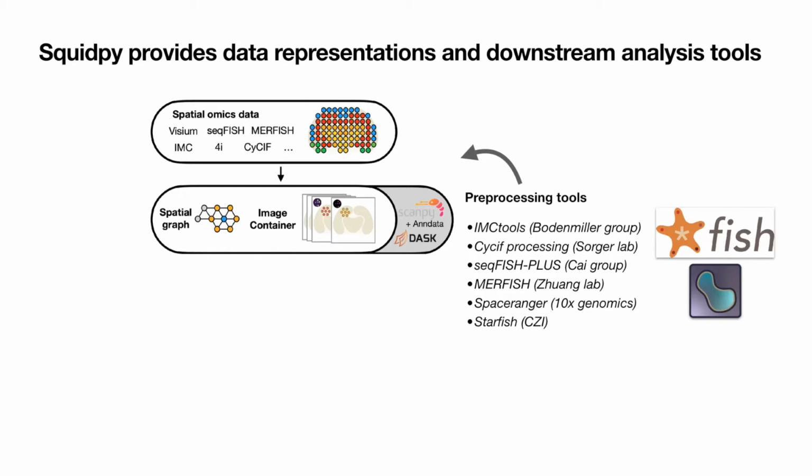Okay. For the data representation that I just talked about, we have one lab coming up. This is the spatial AnnData lab. This is something you can really get your hands on, and we'll provide a couple of examples of how to create these representations in the code and how to work with them, so you can also use your own data and put it in there as well.